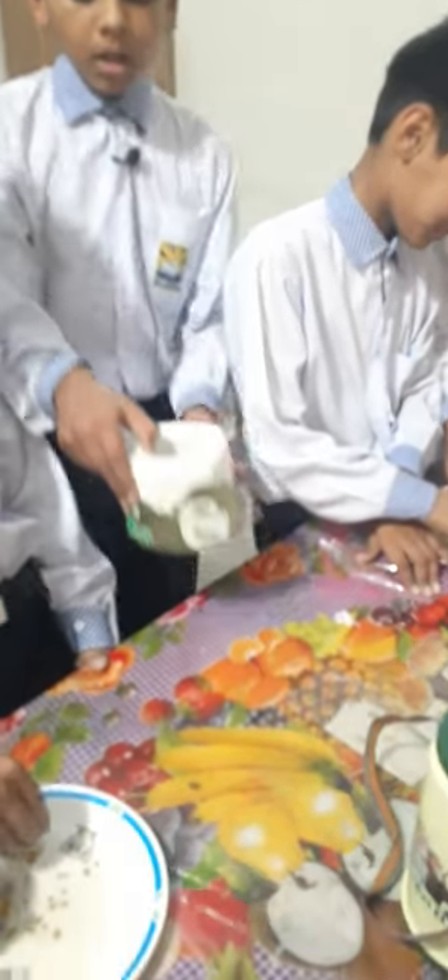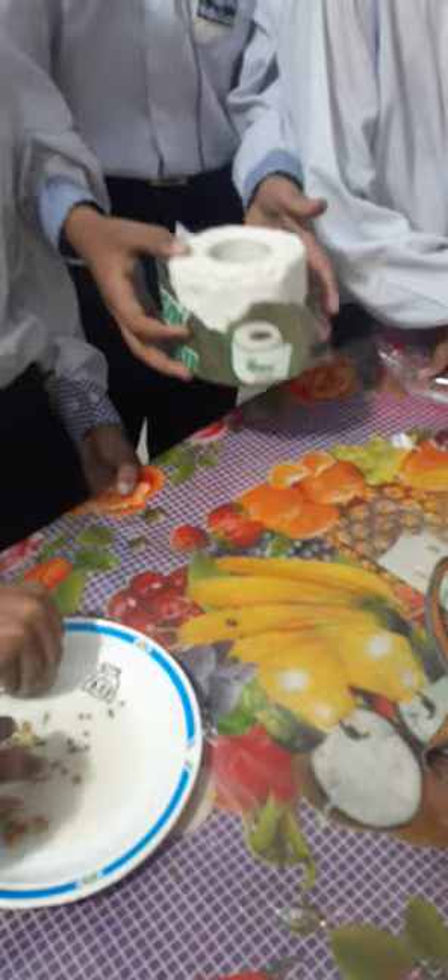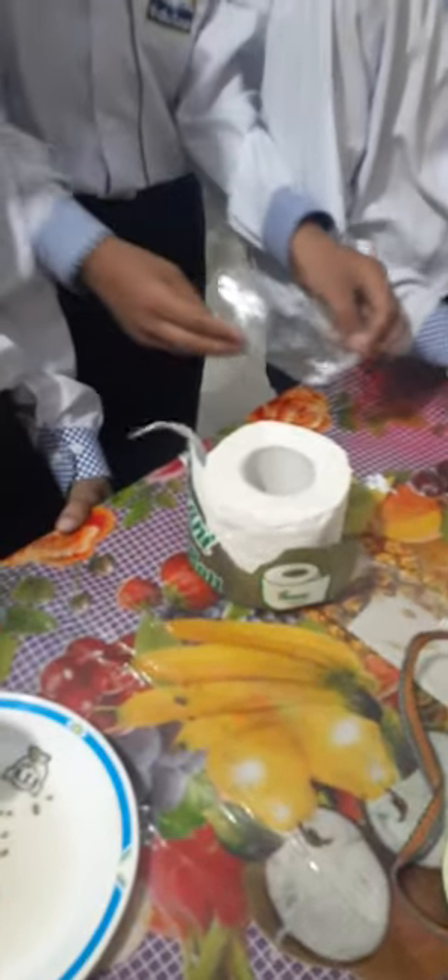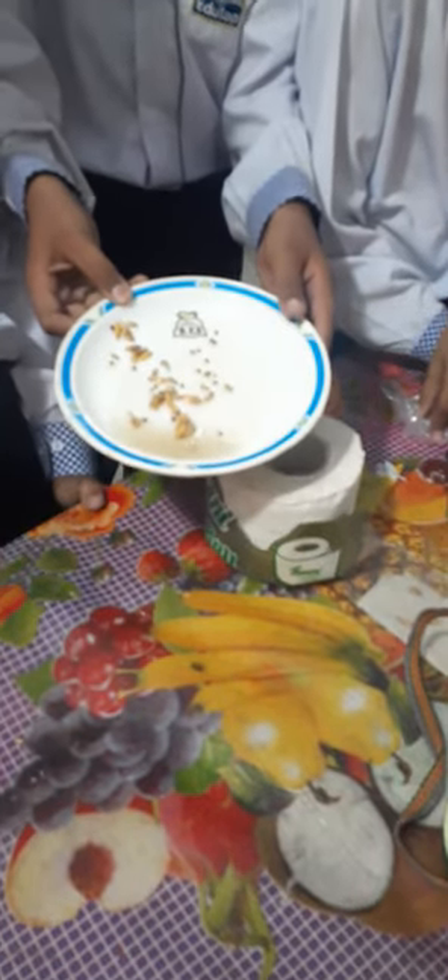We need some materials for this experiment: a roll of tissue paper, a plastic bag, some types of seeds, and some water.